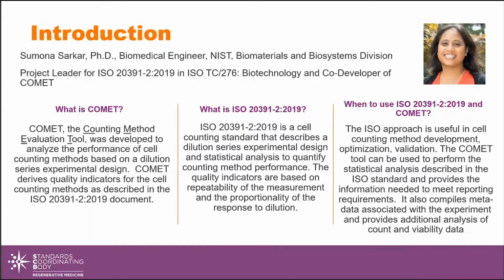The COMET tool itself can be used to perform the statistical analysis that's described in the ISO standard, and it also provides the information needed to meet the reporting requirements that are outlined in the standard. Additionally, it compiles metadata associated with the experiments conducted for this evaluation, and it provides some additional analysis of count and viability data as well that users might find helpful. So right now, we can take you through that tool and do a quick demo to give you an introduction to the tool itself.